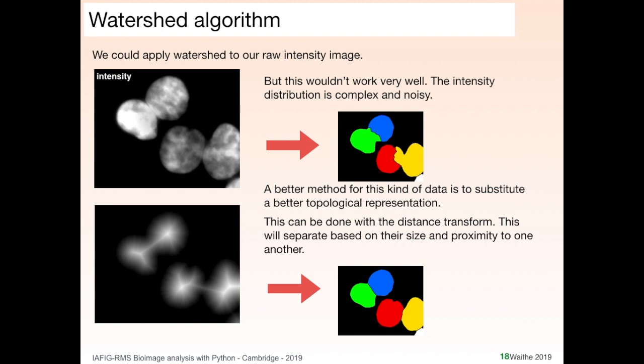The idea of the watershed is that you grow it out until you touch other cells and things like that. But the way you apply it can be different. And you'll see, if you look up watershed online, you'll see different examples. So I want you to know that the watershed is the growing bit rather than what you apply it to, which the most popular method is actually the distance transform. Okay, and you'll see the distance transform method in the practical. And if you want, you can change it. You'll see I'm applying the watershed to the minus distance, and what you can do is apply it to the raw pixel data, and you'll get this as well. Both of them are watershed, but it's just how you apply it. Okay.